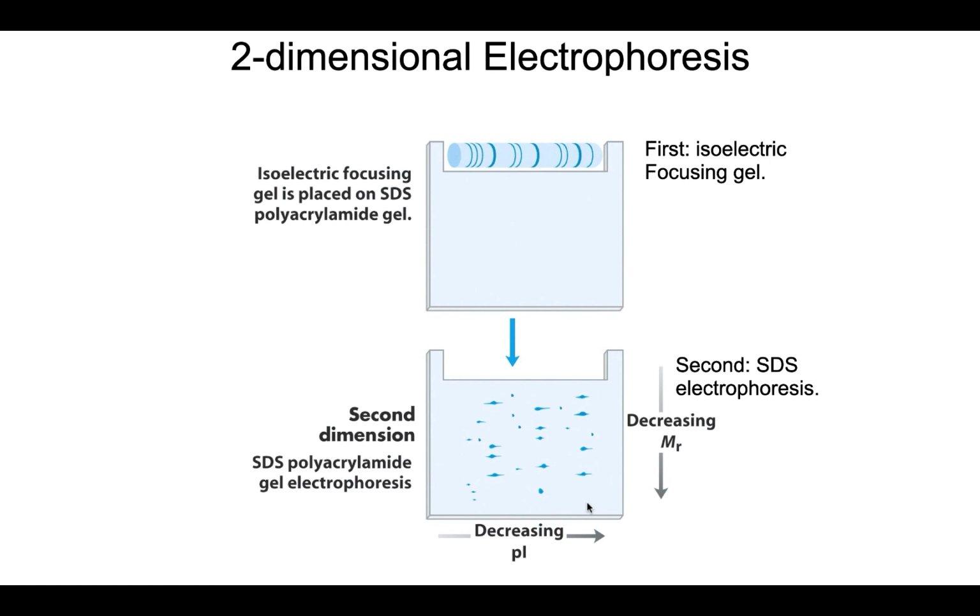This is, again, another way of really separating proteins, because it's then possible to cut out a spot from this gel right here and purify the proteins away from that gel. You've got yourself a really purified batch of proteins when you do that.